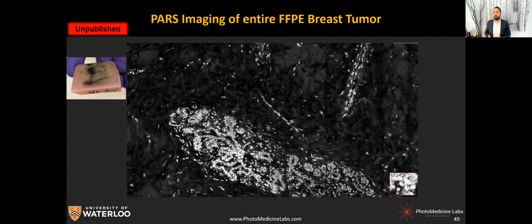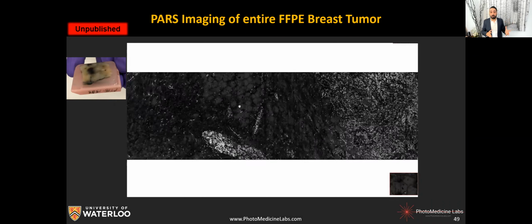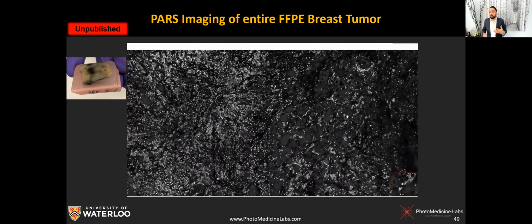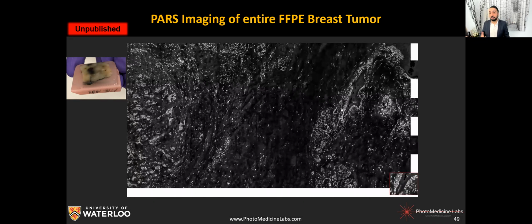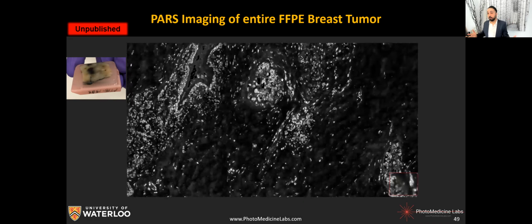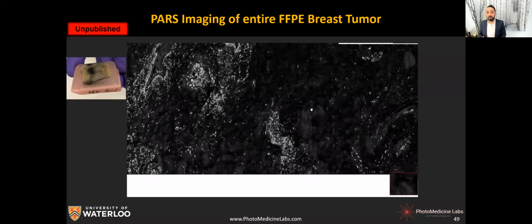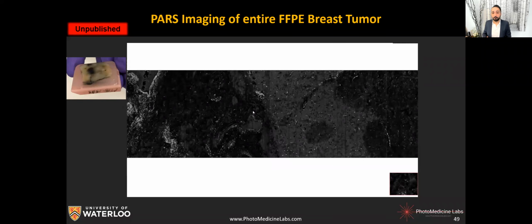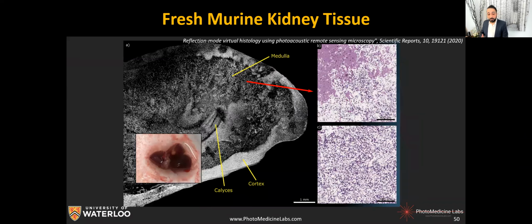So Ben Ecclestone, again, also provided us with some videos here, so we can appreciate the fact that we can actually get the same level of information now in tissue block with this level of resolution. Of course, a lot of image processing, a lot of exciting things can be done, but this has been done almost in a year, in the last years, knowing the fact that COVID has really hit the lab and all experimental work. We really came a good path, and a very strong result has been produced thanks to the amazing things that we have.